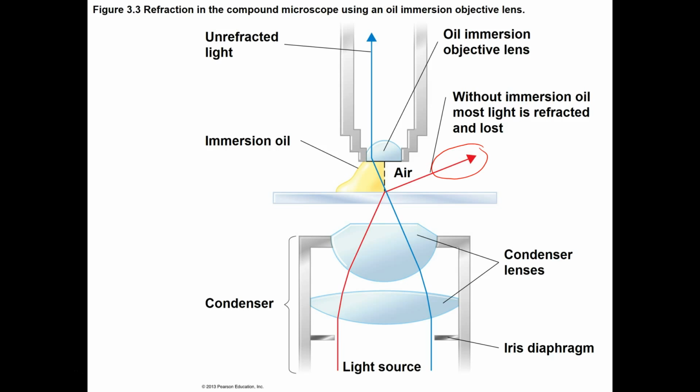So under oil immersion, we're supposed to add immersion oil to our lens. This is why. The oil causes the light to refract less. As you can see with the blue line, as light hits the oil, it doesn't scatter away as severely as it does with the air.